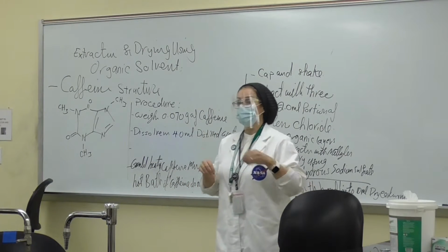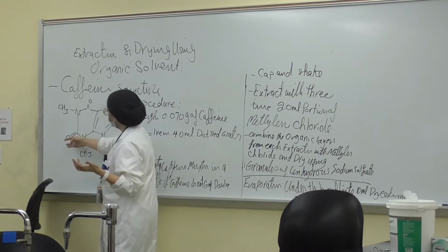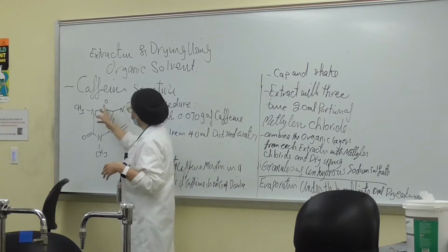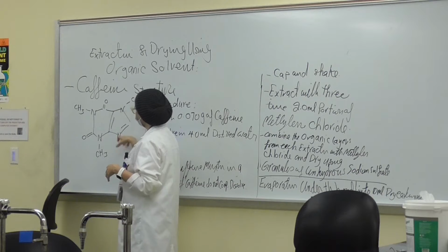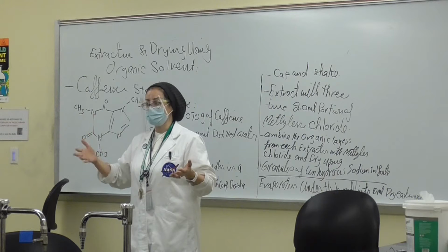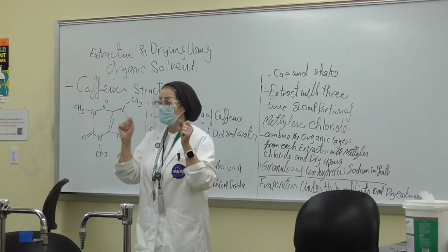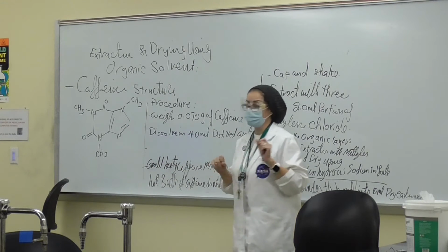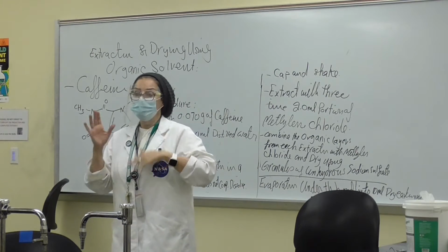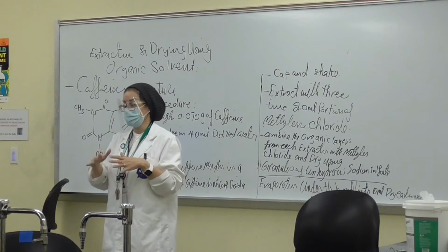Maybe it is not going to be 100% dissolved in water, although we expect that because caffeine has a lot of heteroatoms, like the carbonyl group and the double bond nitrogen. So we expect it to dissolve in water as a polar compound. But in case it does not dissolve, we will apply very gentle heating to dissolve everything. So we try to dissolve everything in the water, okay?